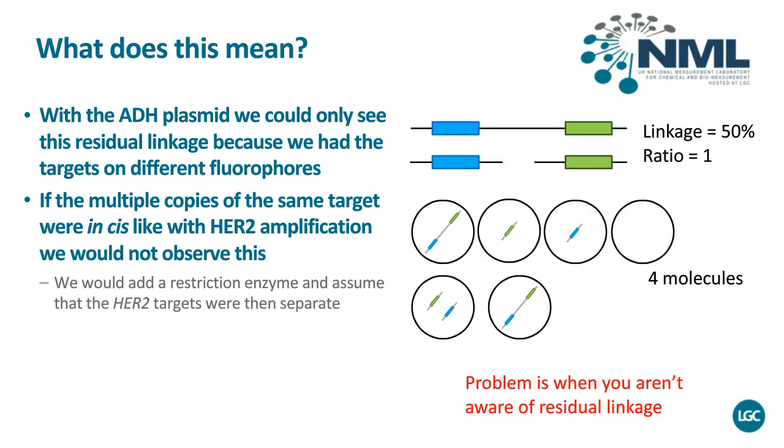But if we look at what we had with that mile-marker assay, where we actually had 50% linkage, even though they were relatively far apart, 33 kb, we would still start to underquant. So this is really highlighting that the problem here is when you have that residual linkage. And while we might be looking at small changes, actually we could be looking at a 50% underquant.